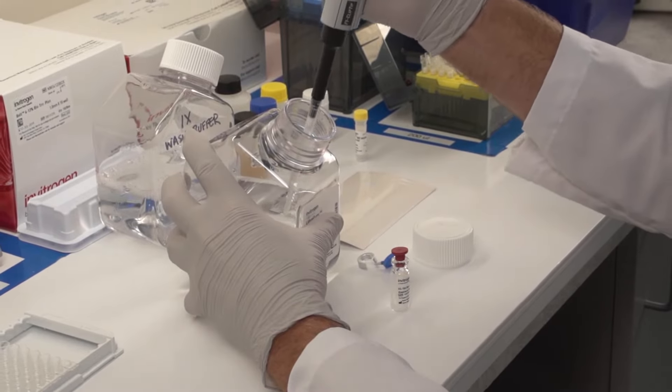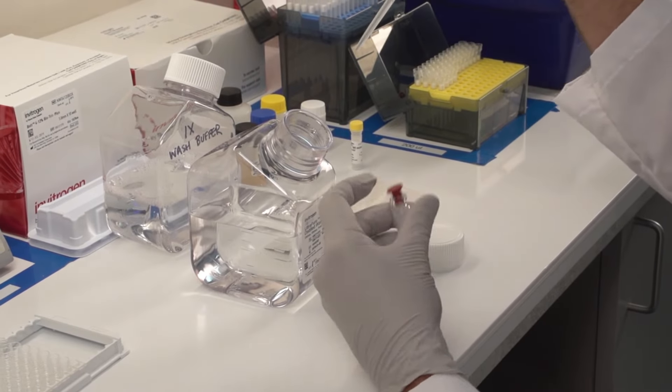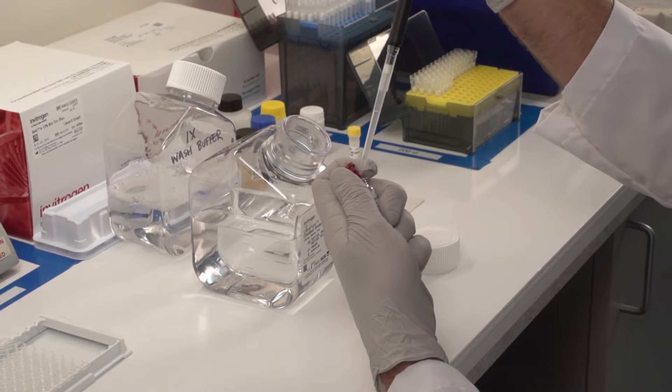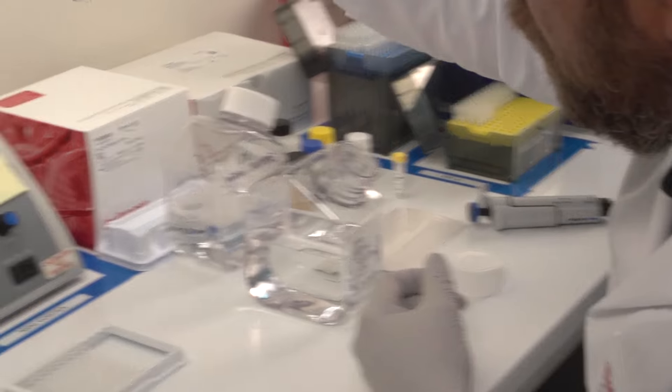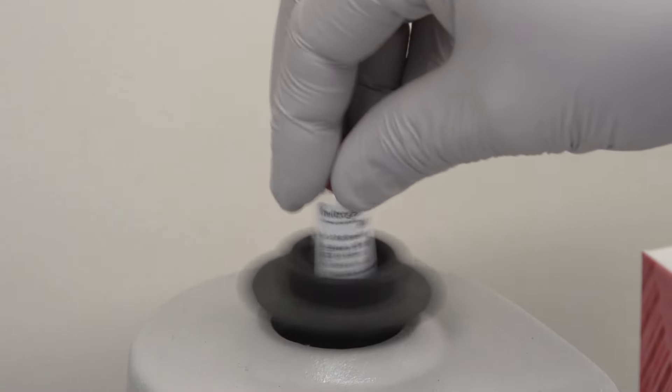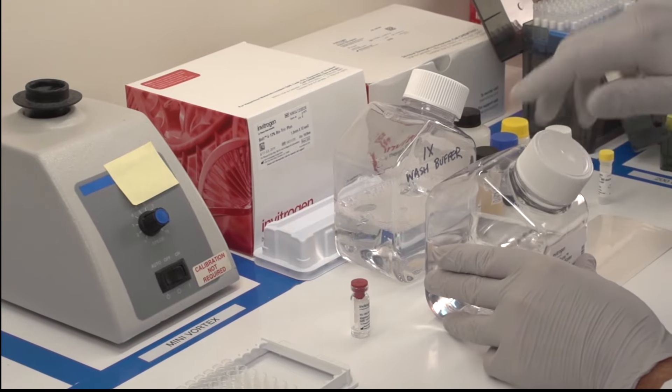Reconstitute one vial of protein standard by following the provided instructions. Handle the protein gently and do not pipette up and down when first adding the buffer. Simply swirl and invert five times, or very briefly vortex, and let the standard sit for at least 10 minutes to ensure complete reconstitution.